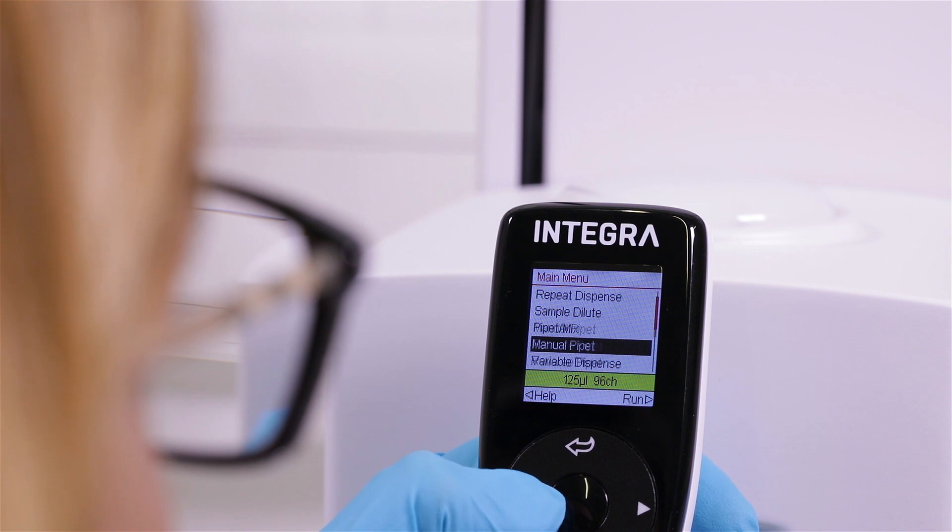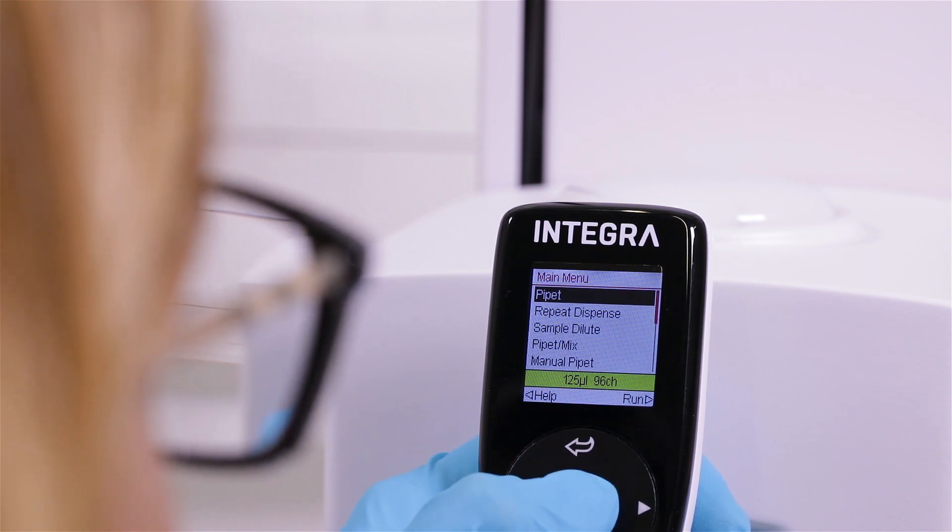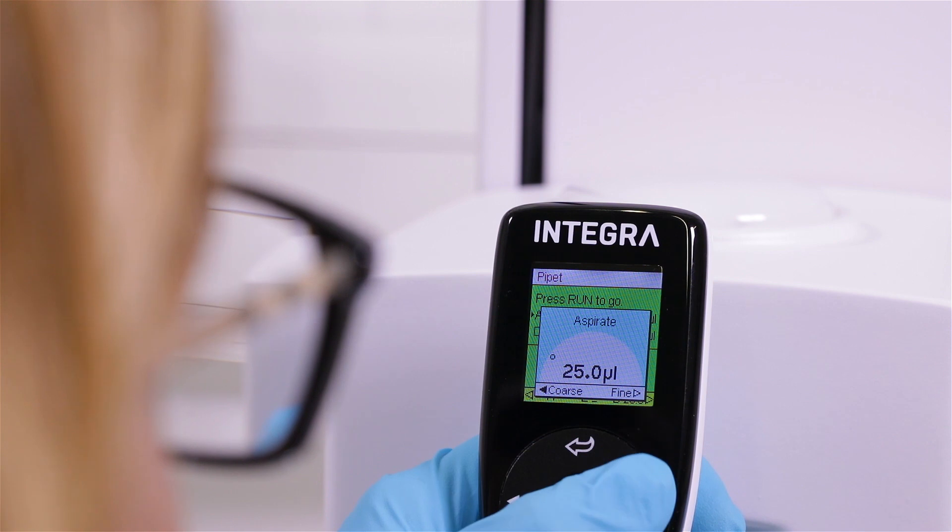The easy-to-use touch wheel interface allows for convenient menu navigation, as well as quick volume changes.